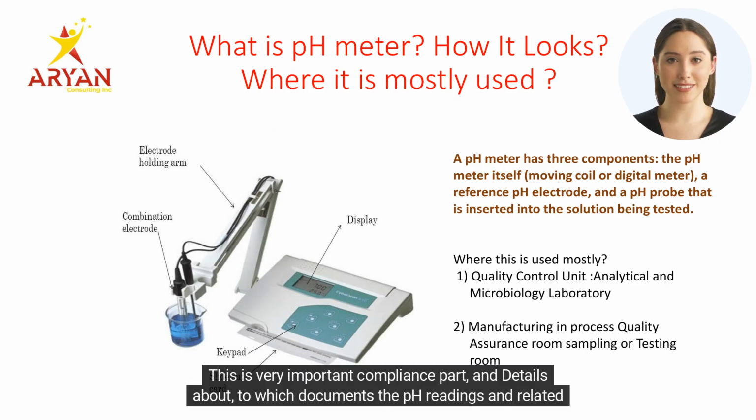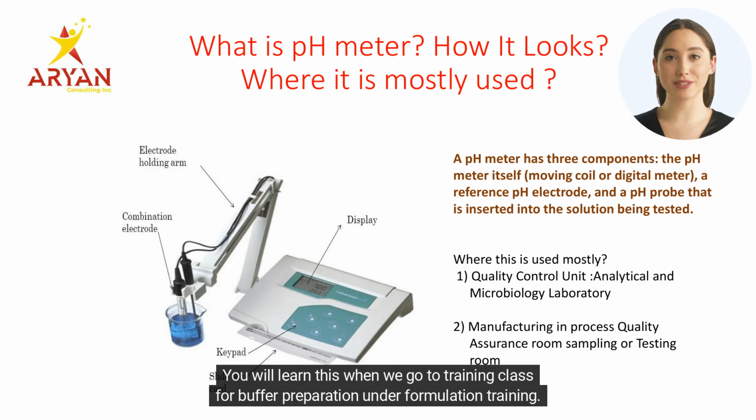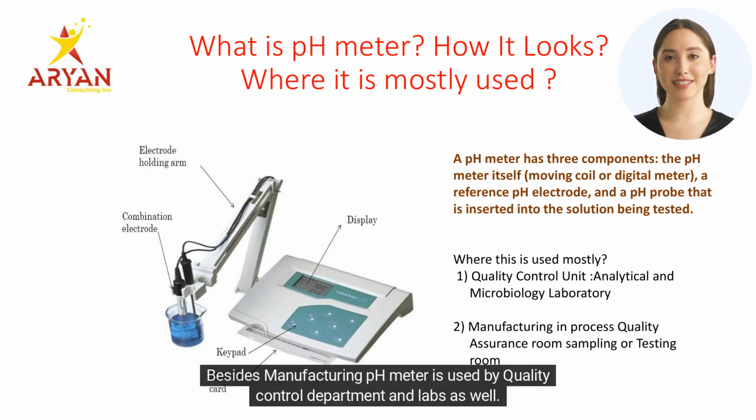This is a very important compliance part, and details about which documents the pH readings and related information are transcribed to, or metadata attached to, you will learn when we go to training class for buffer preparation under formulation training. Besides manufacturing, the pH meter is used by the quality control department and labs as well.